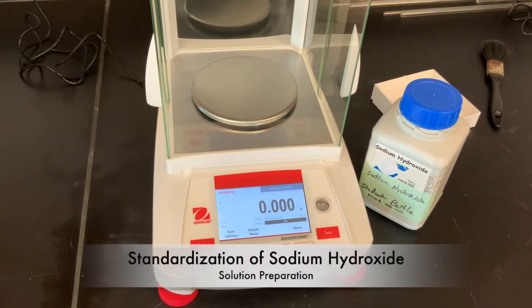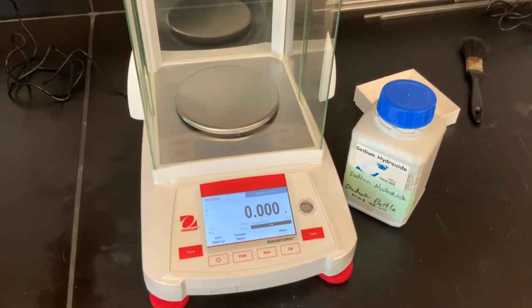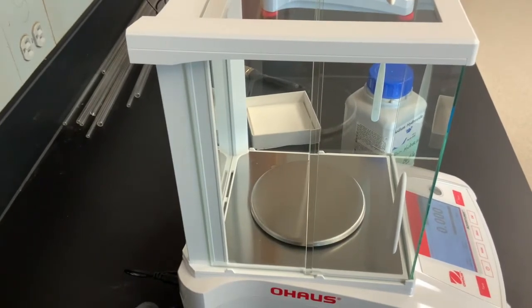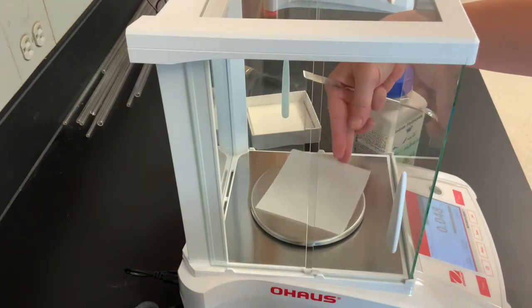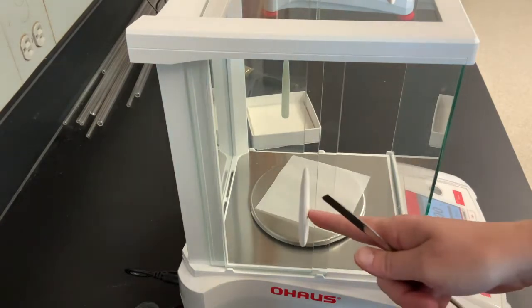To begin our experiment, we're going to prepare a solution of sodium hydroxide. We're going to start off by measuring approximately 10 grams and dissolving it in about a liter of water. So first we'll put down our weigh paper and make sure that we tare the balance. And then we're going to measure out our sodium hydroxide.